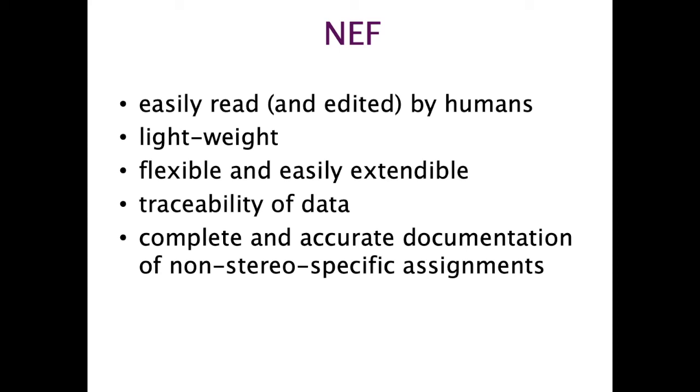That information, once it's been lost, is gone and can't be recouped. Now finally NEF allows us to correctly store that information.